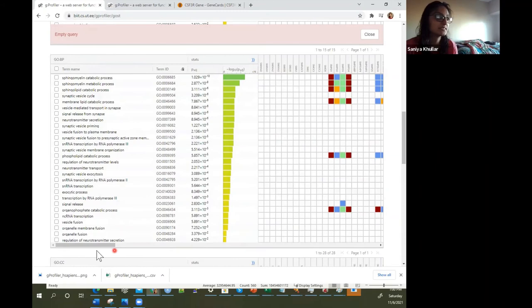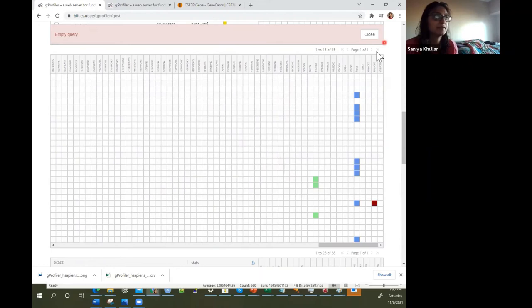You can see all these results for gene ontology biological processes — regulation of neurotransmitter secretion and many more. There are also results for cellular components, KEGG pathways, Reactome, and RNA polymerase 3 transcription and transcription initiation.